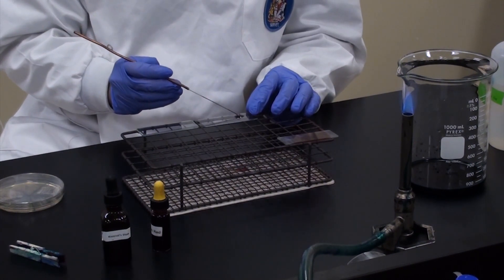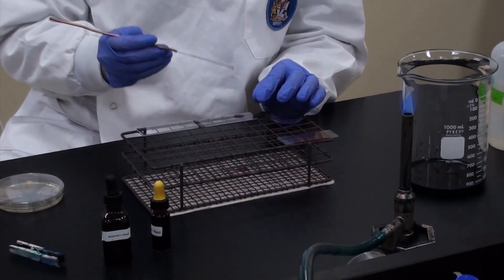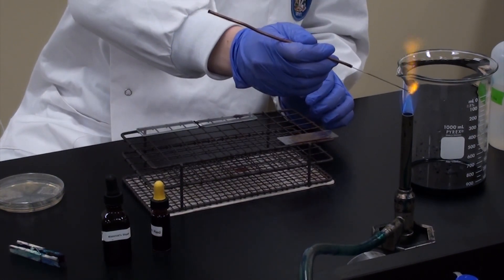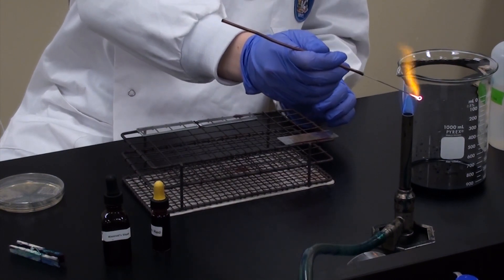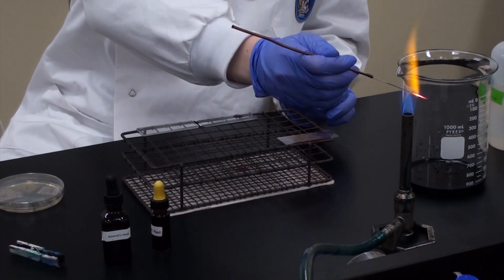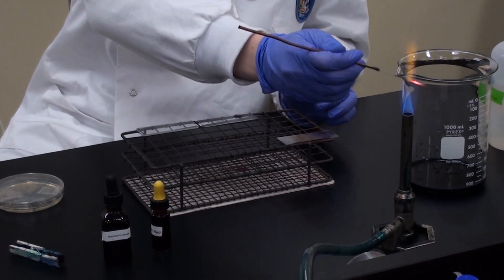You'll then mix it into your negative stain. Flame your loop again, just as we did before. All the way down. Let none survive. So on and so forth.